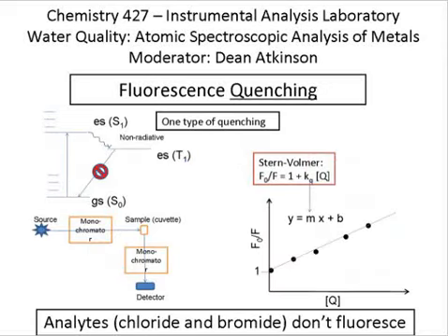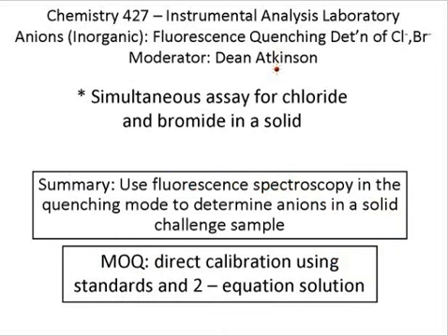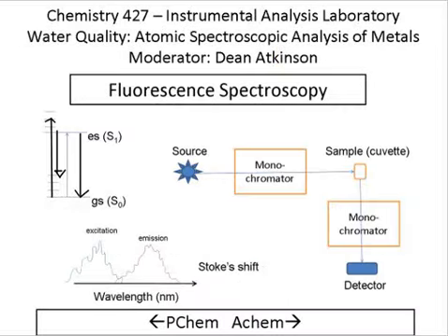The experiment that we're doing here is fluorescence quenching. So, I just realized that the titles on all of these slides are wrong. I think I'll go ahead with the wrong title on the top of these slides because the first title was right. So when you pick up on the fact that these titles at the top are wrong, hopefully that won't throw you too much for a loop.